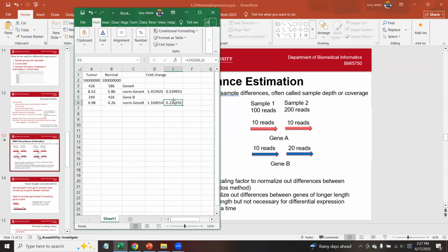So it just looks better on plots. And as you know, a log fold change of 0 is a fold change of 1, and a log fold change of 1 is a fold change of 2. Log 2 fold changes messed me up at first, but I can think in log 2 fold changes now. Okay, I'll save this.